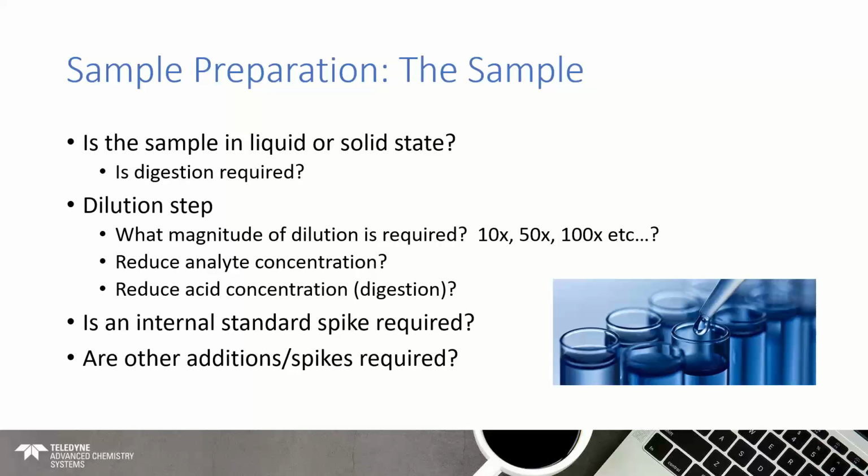What you might find in terms of sample preparation as well is that if you've got a large number of samples, say a couple of hundred samples, you might have to do exactly the same dilution on all of those samples. So the same dilution factor, say a 10-fold dilution or a 100-fold dilution, might have to be applied to all of those. Then once you've diluted your samples, how do you incorporate things like an internal standard? You could spike it into your samples, or you could incorporate an additional internal standards flow through the sample introduction aspect of the workflow. That's another question to answer.